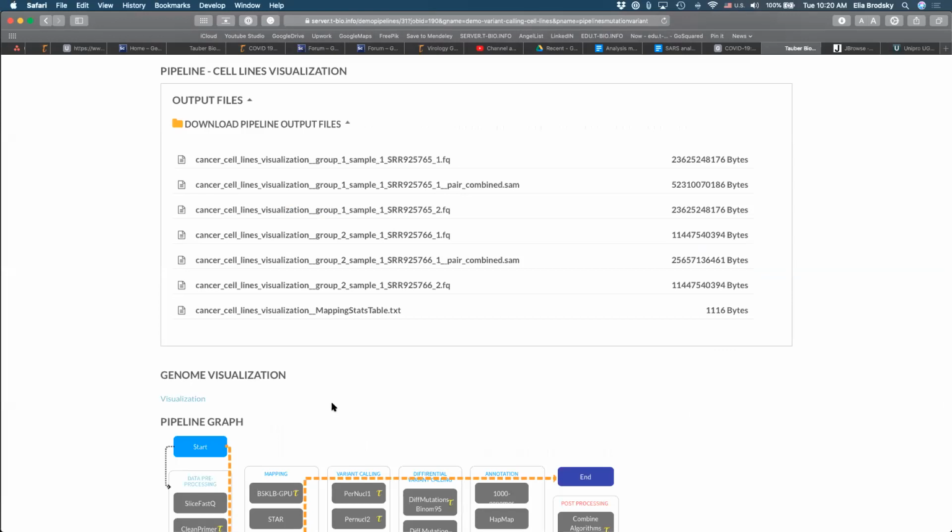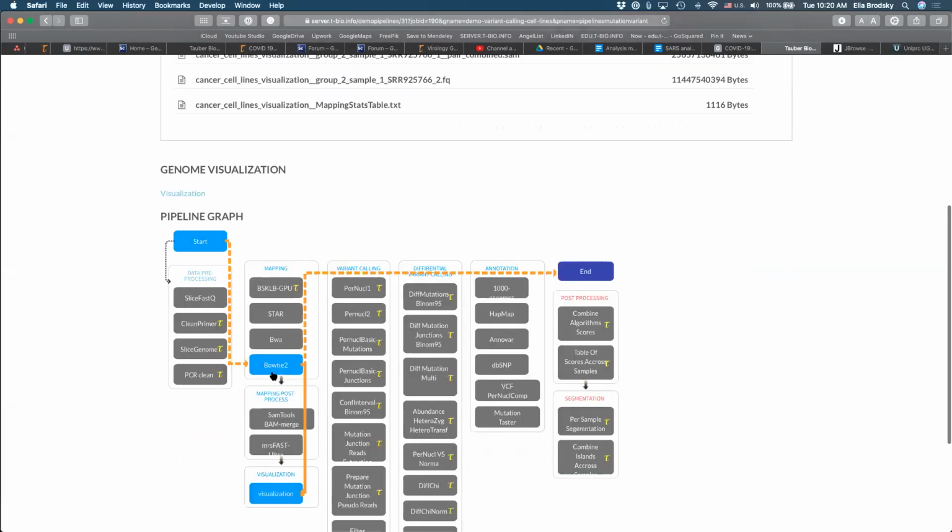So if you process your data, typically you don't start with a SAM or a BAM file, you start with a FASTQ file. And the SAM file is generated from Bowtie. You can also install Bowtie on your computer and run that. And once you generate the SAM file or a BAM file from Bowtie, you can visualize it in JBrowse, Genome Viewer, or UGene, for example. Okay?